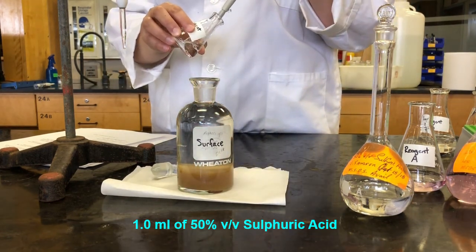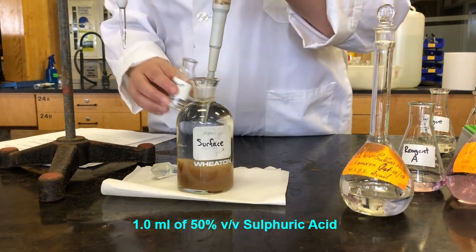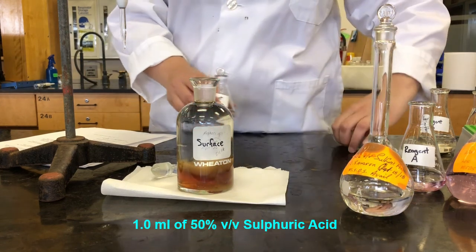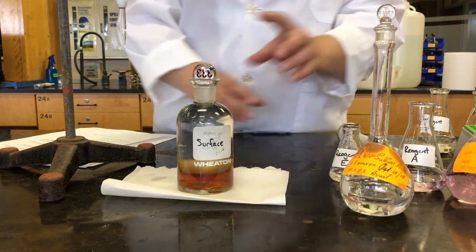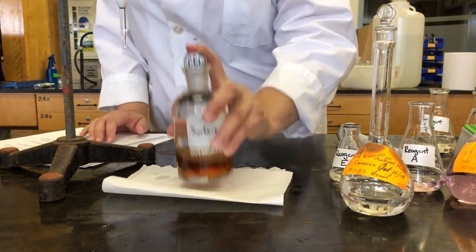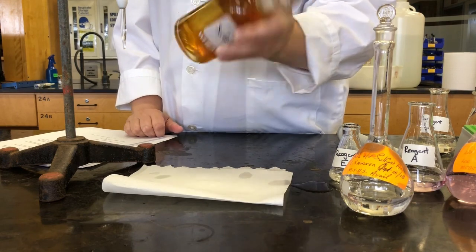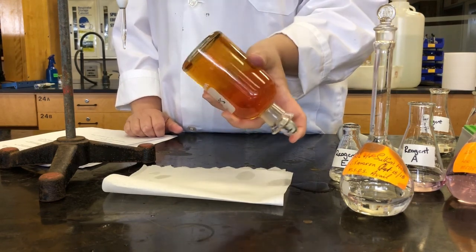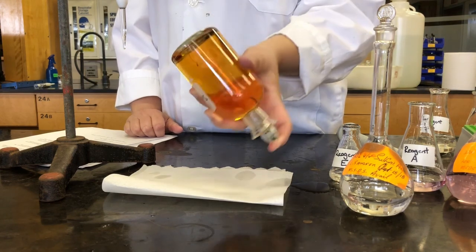So again, I'm using the Eppendorf pipette for that. Okay, put the stopper back on, and now we're going to mix it. And you start to see that brown precipitate dissolve.